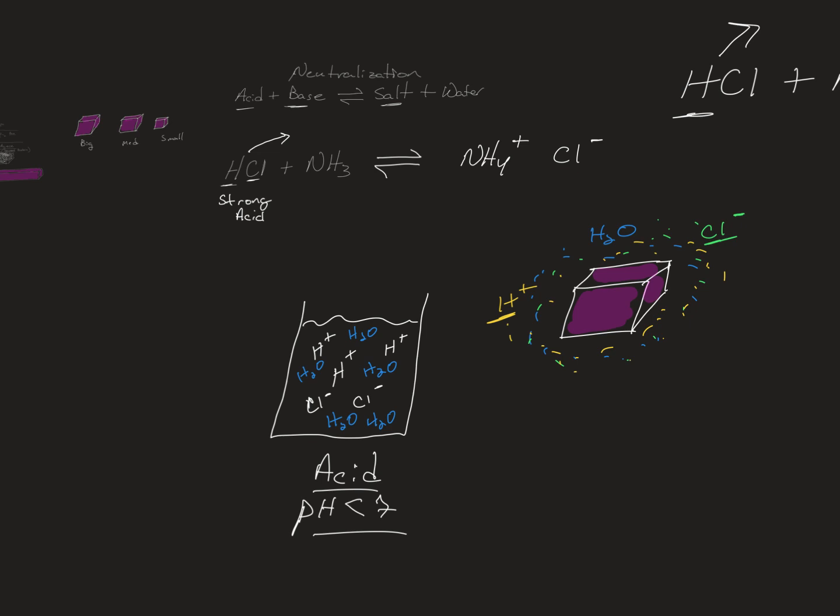Is it going to neutralize? They will, but how are they going to neutralize? How are they going to get to the base? Where's the base? It's in the gel. So it's going to go into the gel. Why would the H pluses go into the gel? Hint, you already know the answer. How would the H plus get into the gel?